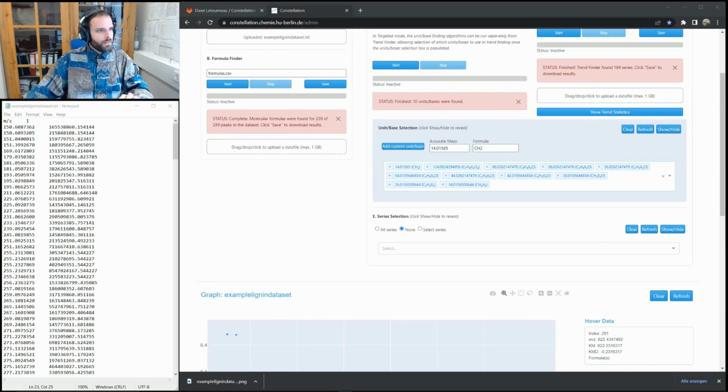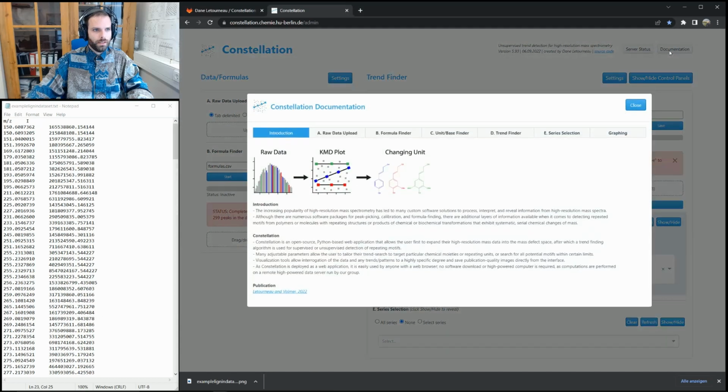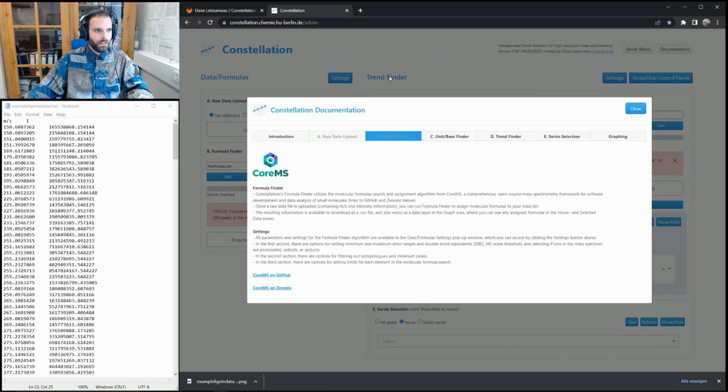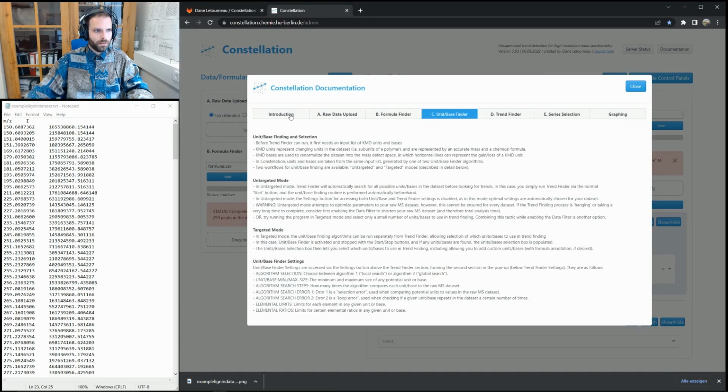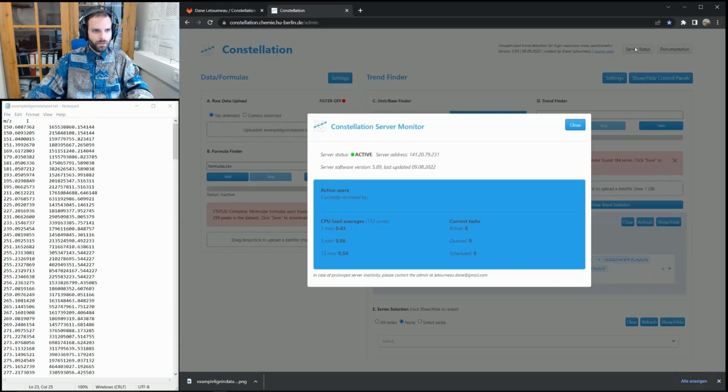So that's pretty much it for the general introduction. I hope it was informative, and if you need more information, please first, if you can, refer to the documentation here, which I've written to try to guide you through the program as best as I can, or send an email to me. You can find my email if you go to the server status. It's just at the bottom of the window here.